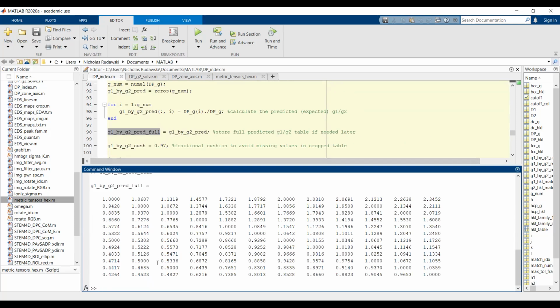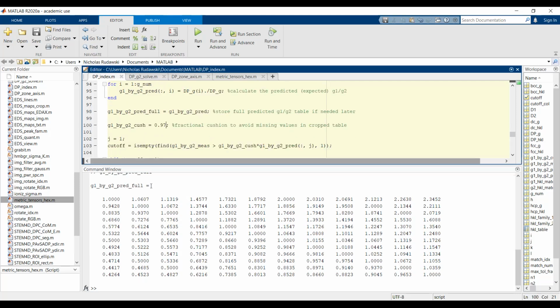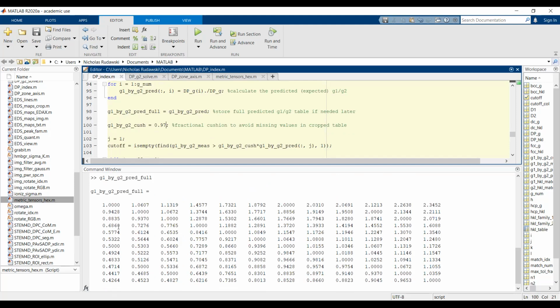Right, let me pull this up here. Okay, so here's the table right here. So we've got a bunch of hits here. Let me see if I can't tighten this up even more. So my ratio, what did it give me? It gave me a ratio of 0.96.